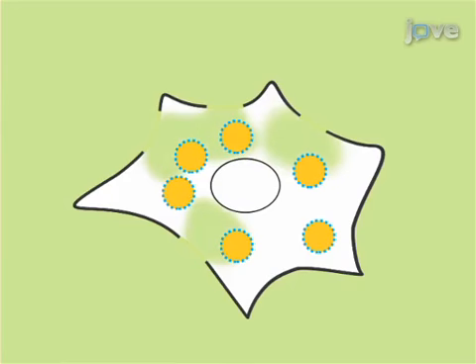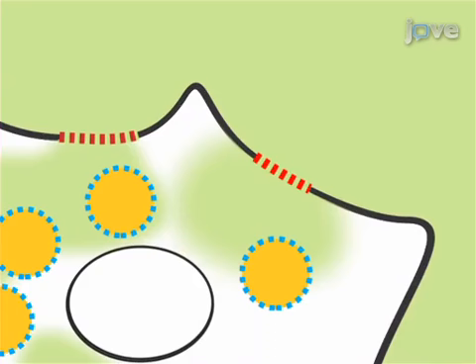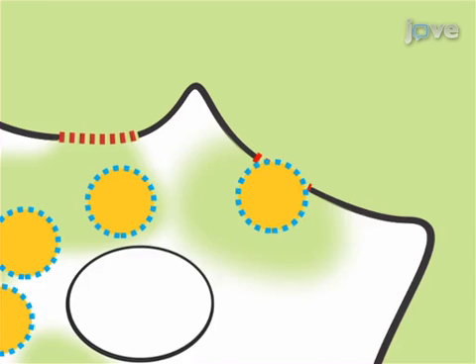As a second step, we monitor the appearance of intracellular proteins at the injured cell membrane, which identifies the ability of a cellular compartment of interest to participate in repair by fusing to the injured cell membrane. Next, we monitor fusion of cellular compartments of interest with the injured cell membrane in order to monitor the kinetics of injury-triggered fusion of this compartment.